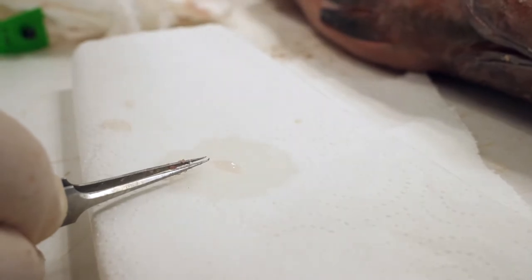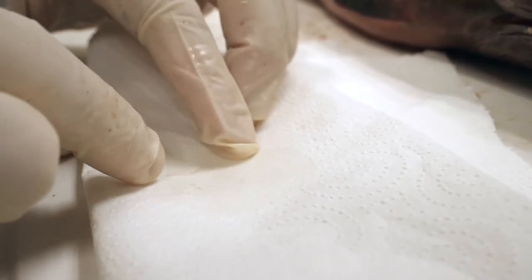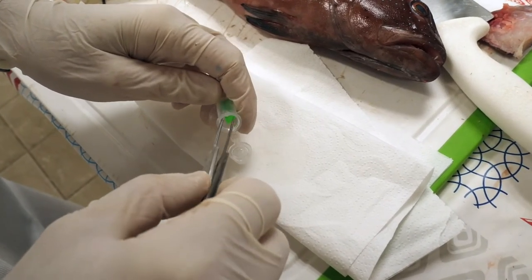Last step: clean the otoliths with the cleaning agent and dry them with paper towel before placing them in a labelled container.